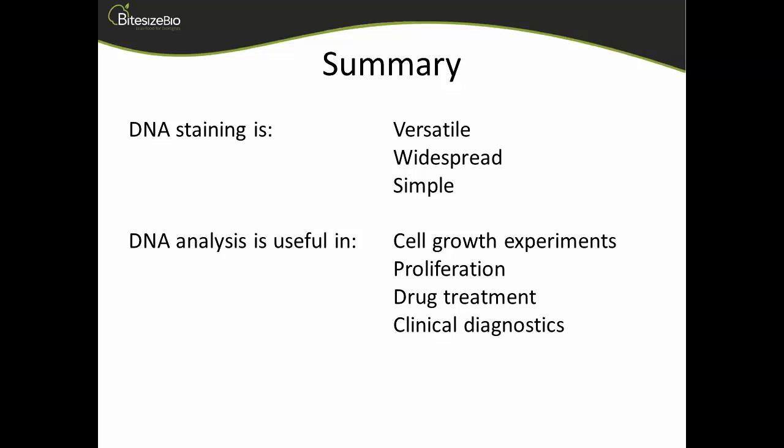Next question. So can you choose CD14 monocytes gated, and then on DNA histograms on this selected cell population look at G0, G1 and G2 DNA levels, with and without culturing mixed leukocyte cultures with standard media and a proliferation agent added to cultures? So I guess maybe it's, can we do various different tests on the one sample? Yes, I mean, this is the beauty of flow cytometry, isn't it? As long as we've got the fluorochromes available to us, we can add as many as our flow cytometer will let us.